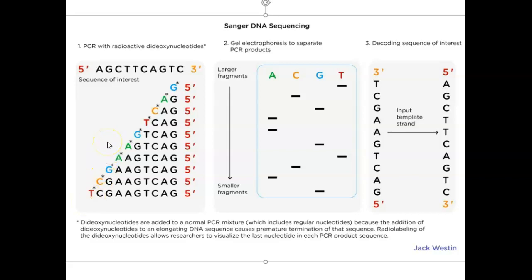It's very efficient. It's very fast. If I were to set up a PCR at like 10 in the morning, I would actually have the sequence, the full reading of the genome sequence of even, say, maybe a 600-700 base pair fragment. I would have that information by about 3 in the afternoon, which is way faster, and it's getting cheaper as well.